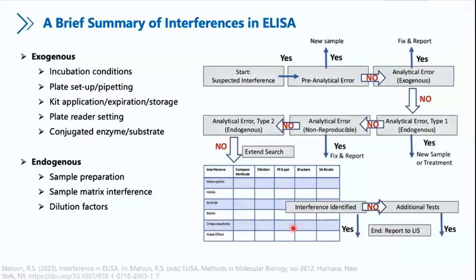So overall, at the very end, when you get an abnormal ELISA result, don't worry. It can come from so many sources of interference. Regarding that, here I just introduce our quick workflow to guide you from the sample preparation, and to analyze the interference from outside or from inside before you make the analysis. You can just follow this pipeline to exclude any possible causes that may happen.